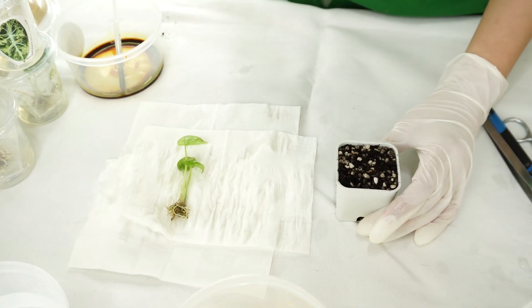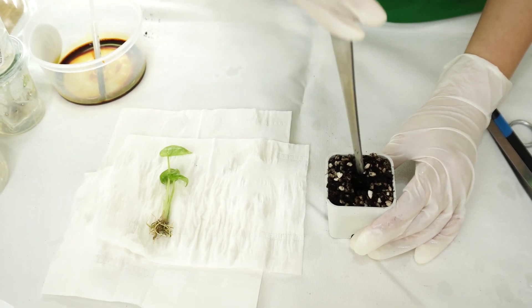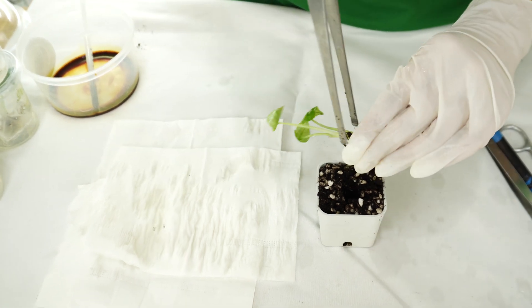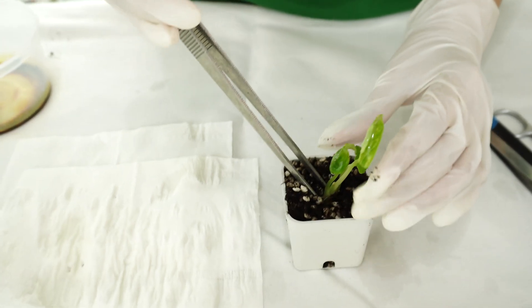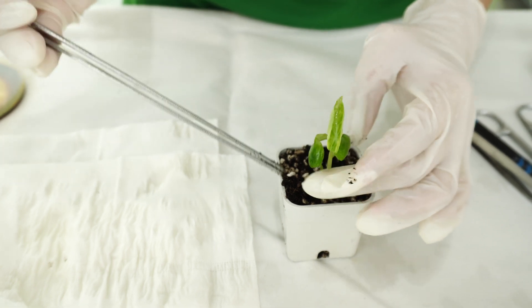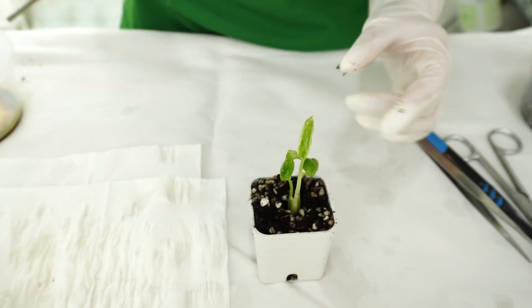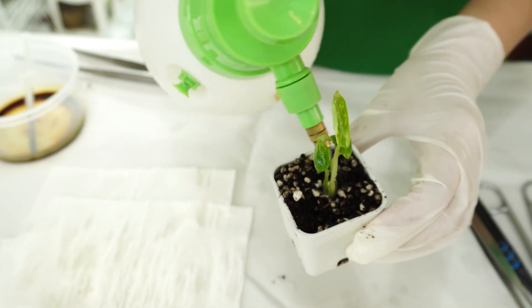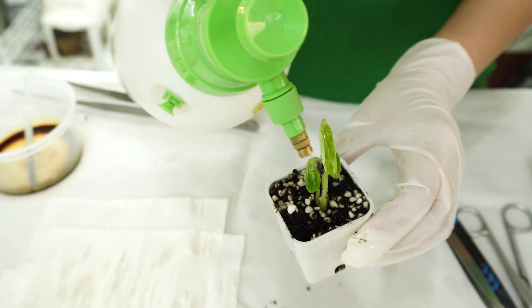Now we're going to prepare our little pot — make a little hole in the middle, then take the plant and put it inside the pot and secure it a little bit. Give it a small amount of water; make sure that you don't overwater the plant.